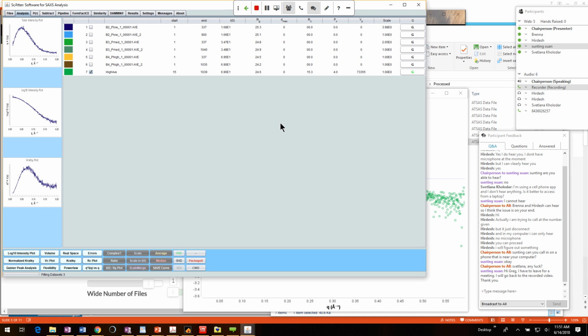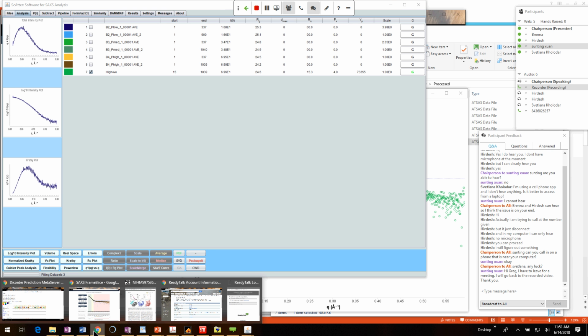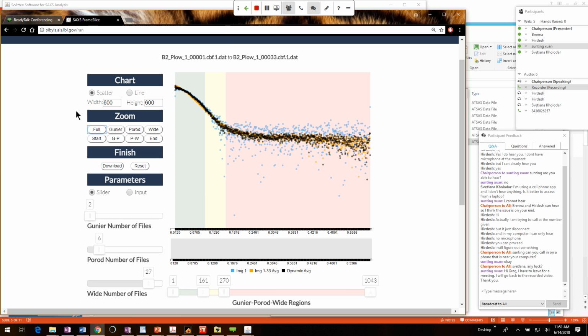I'd probably send the sequence in for disorder prediction, just to confirm, see how much disorder there is. This Metapredict is one way of doing that. Let's see if I got one open here.